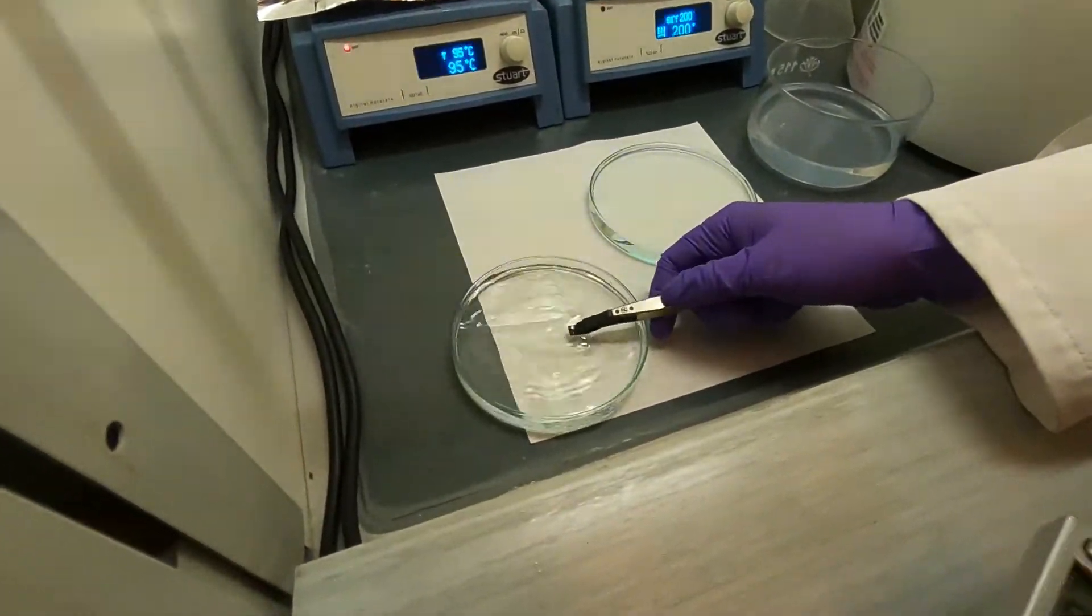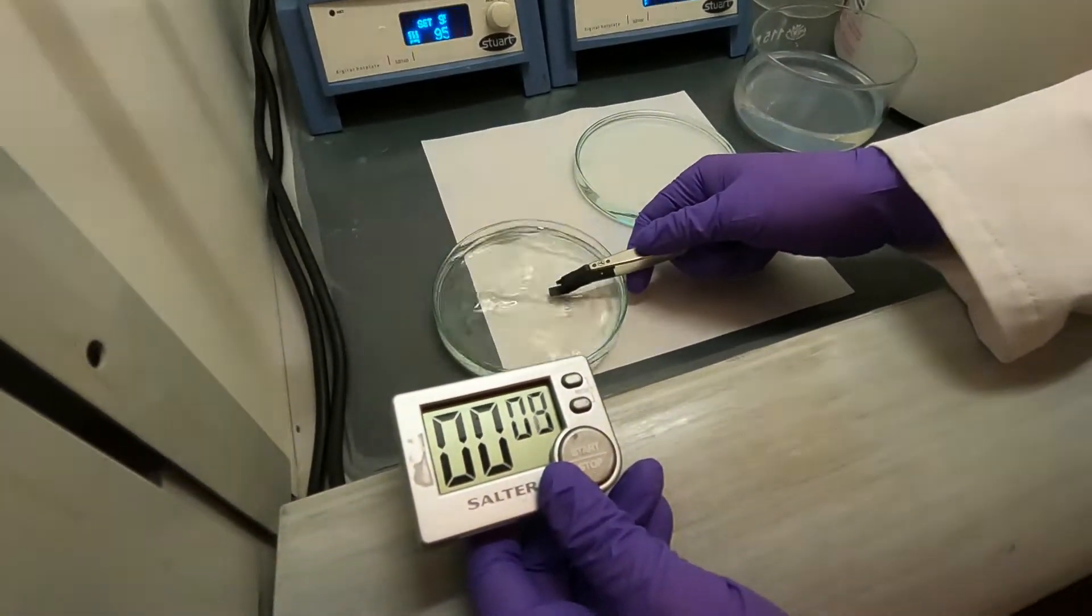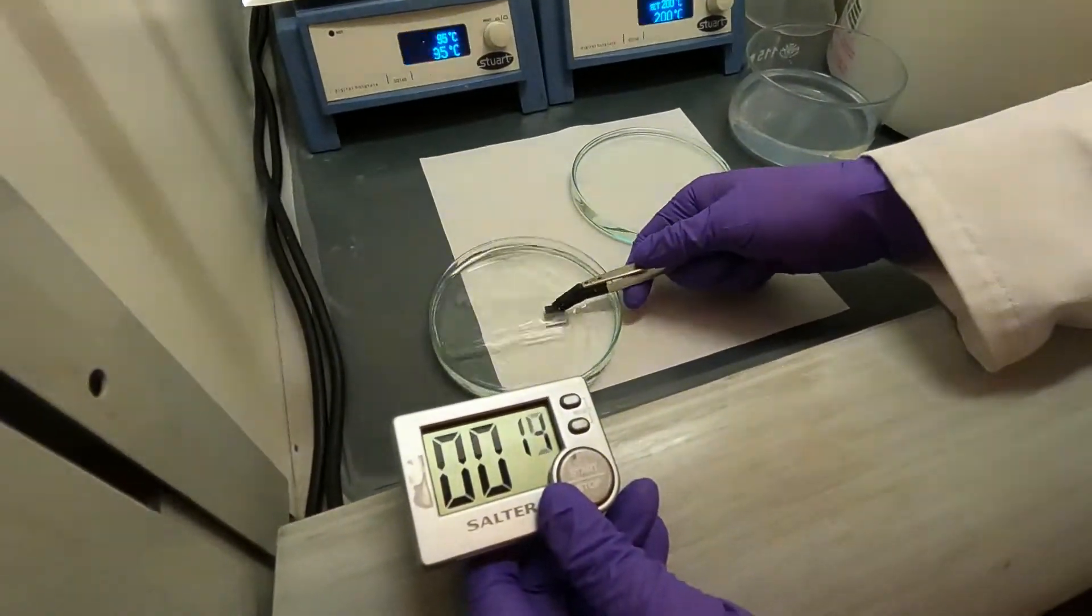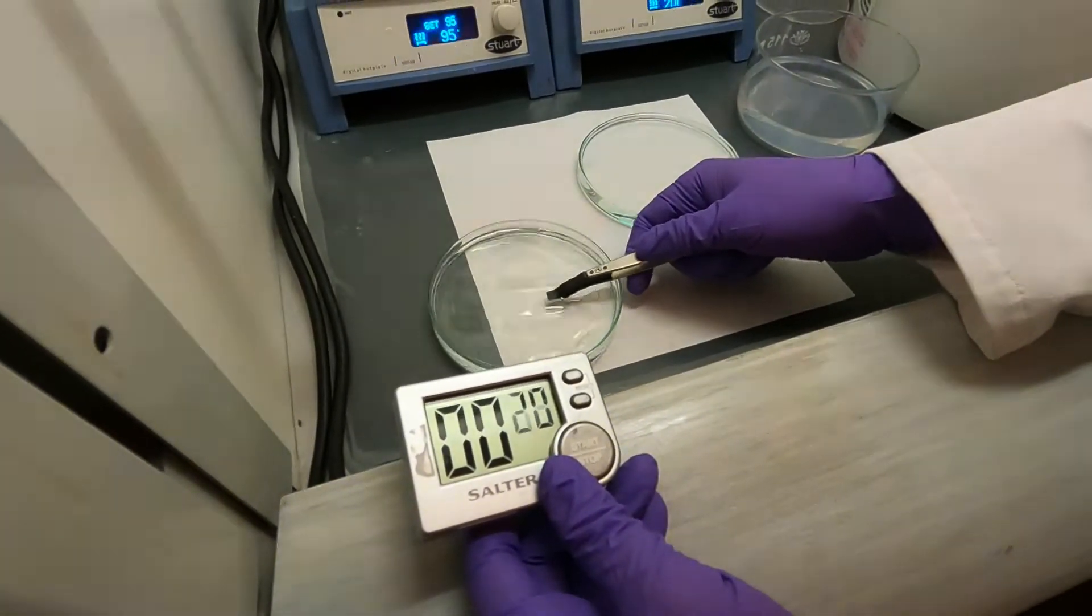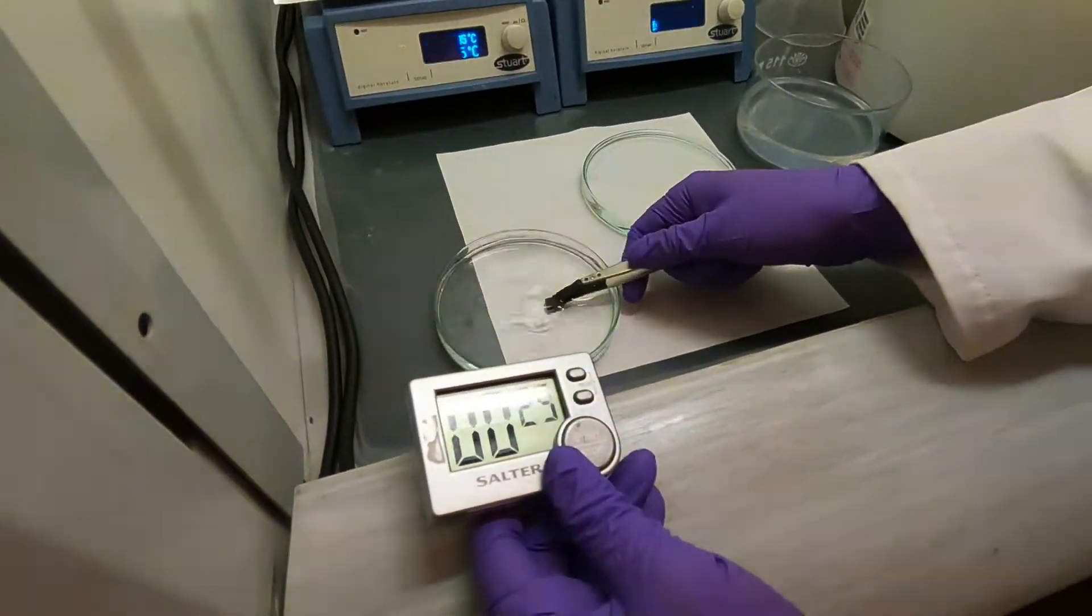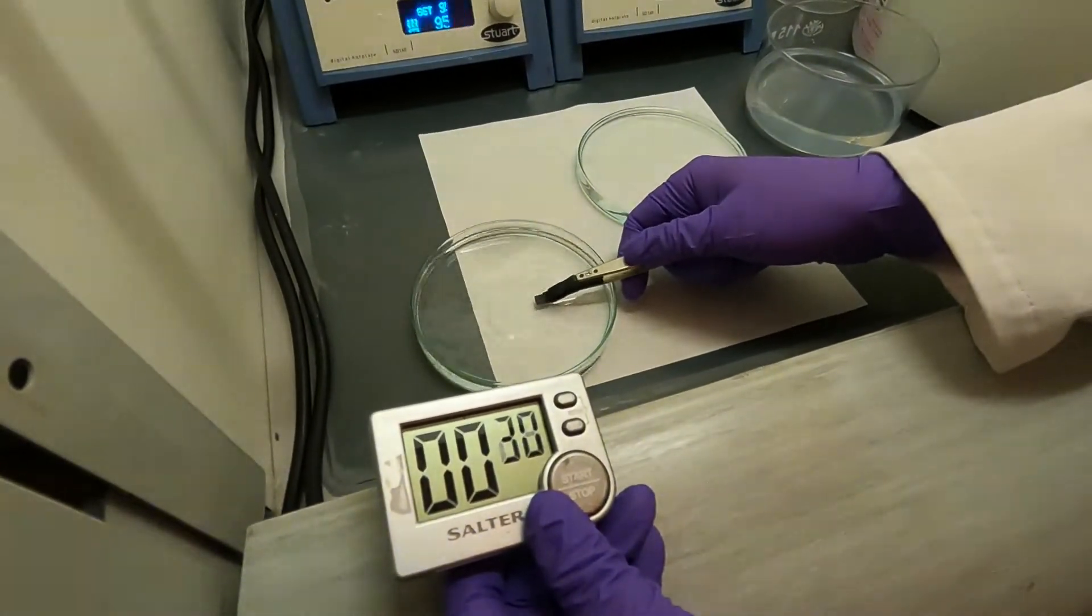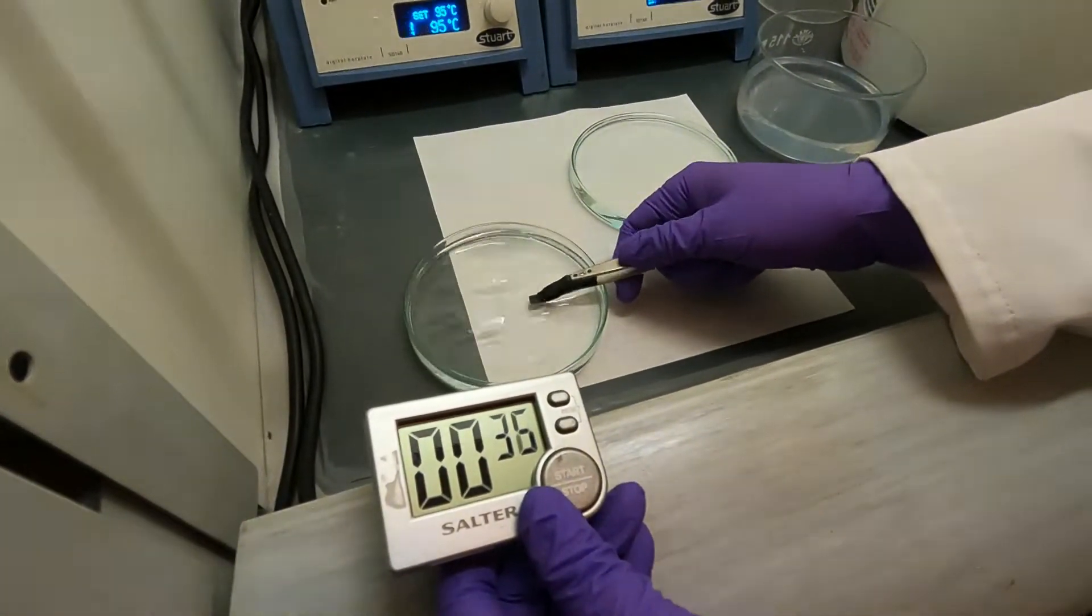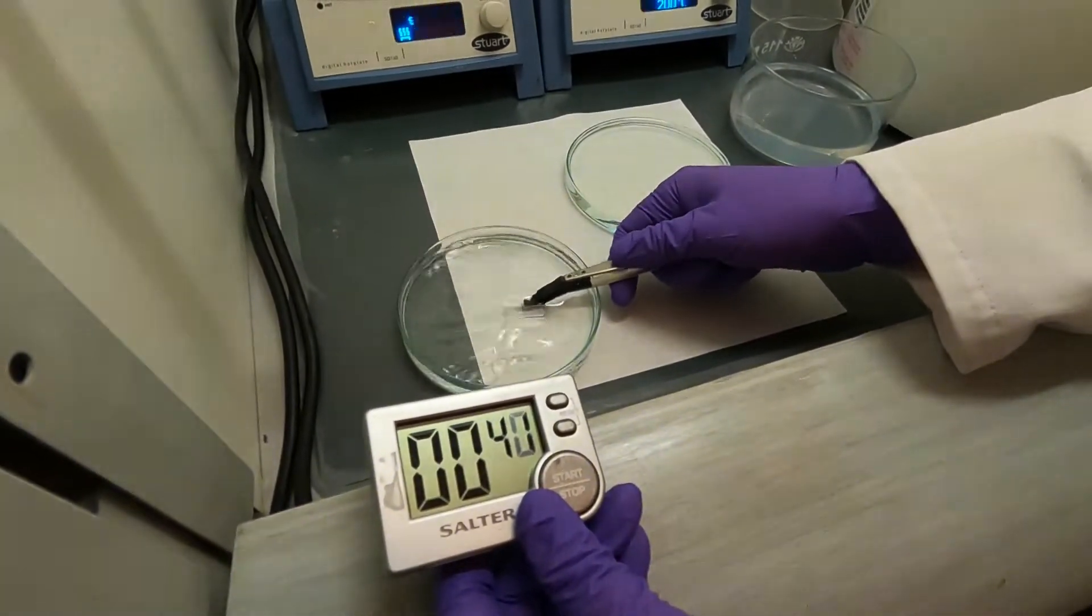I'm now starting the timer. All you want to do is gently shake your sample. I tend to keep a loose grip on the sample with the tweezers to avoid dropping it inside the petri dish. I'm expecting one minute thirty to two minutes is the right amount of development, but I'm going to extract it at around one minute and go straight into the isopropanol to show you what it looks like when the sample is underdeveloped.